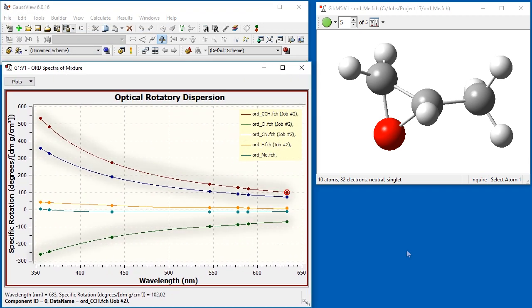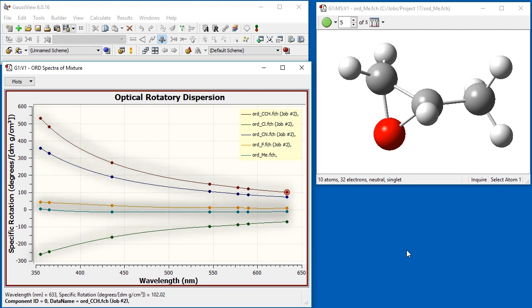Opening the mixture spectra shows the results for all five molecules on the same graph. For three of the substituents, the absolute value of the specific rotation decreases with increasing incident light wavelength. For the other two substituents, there is much less variation.